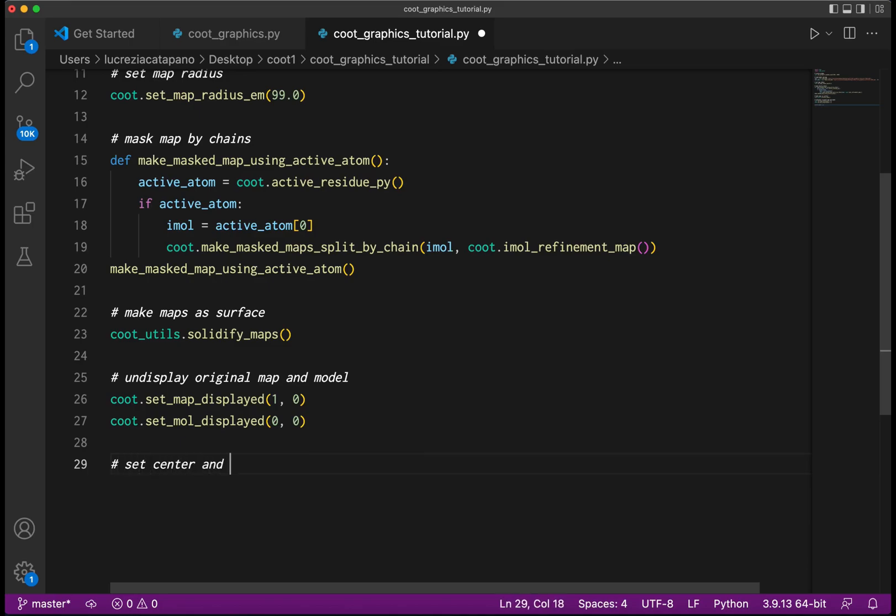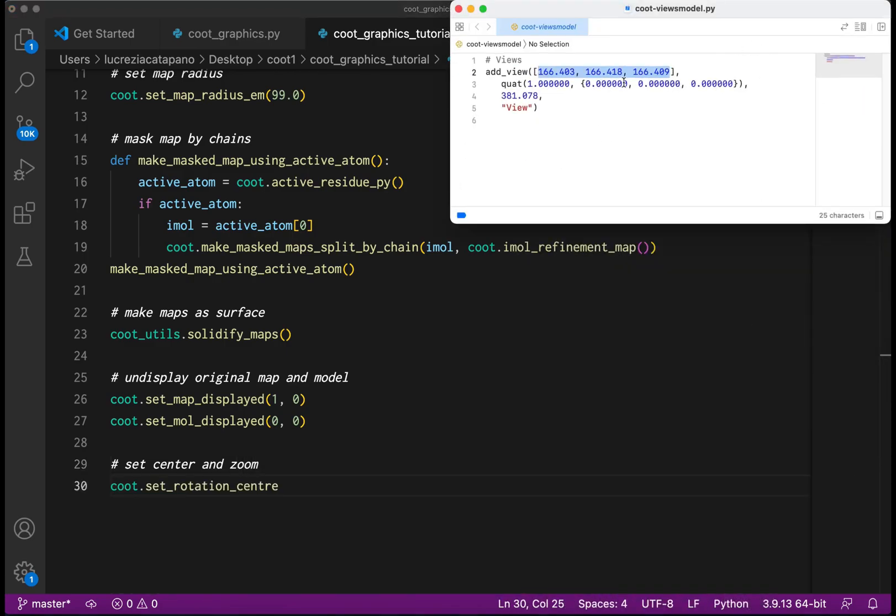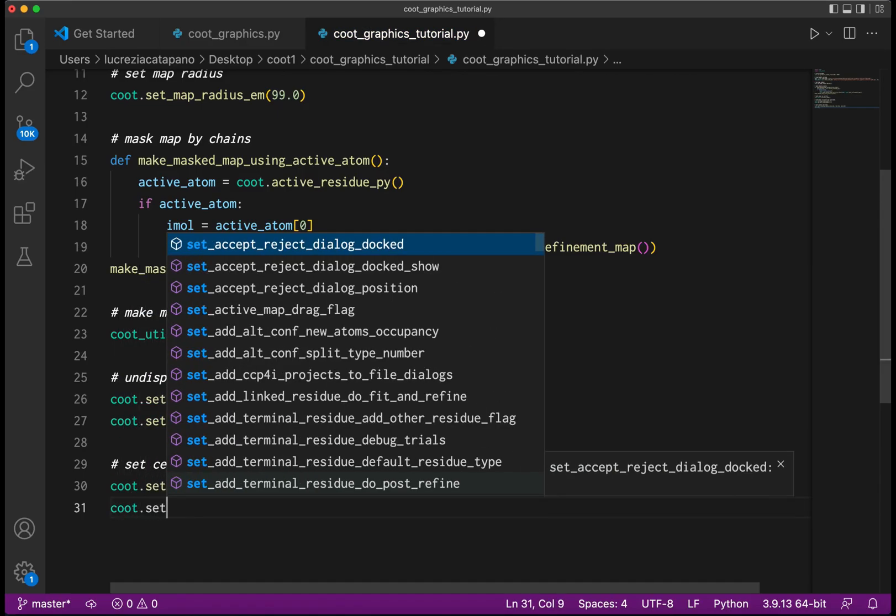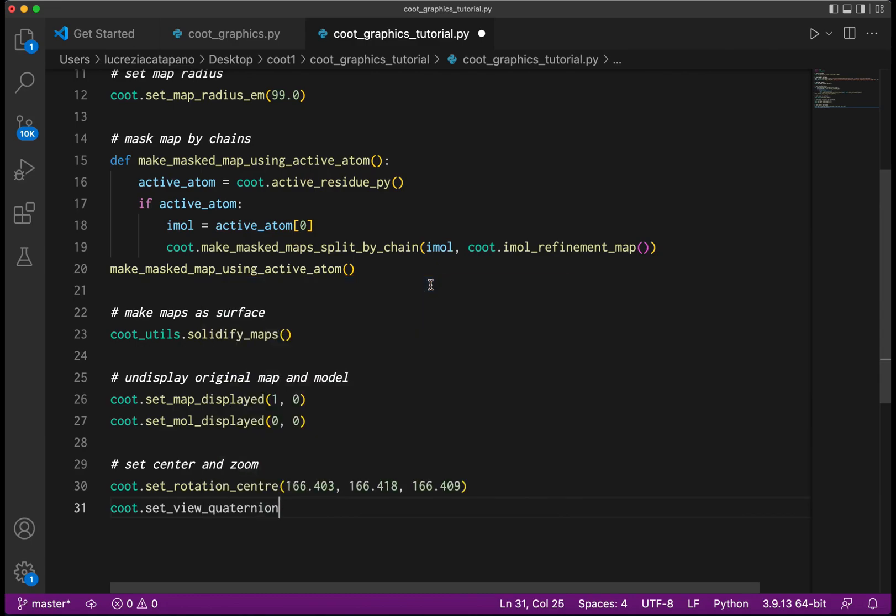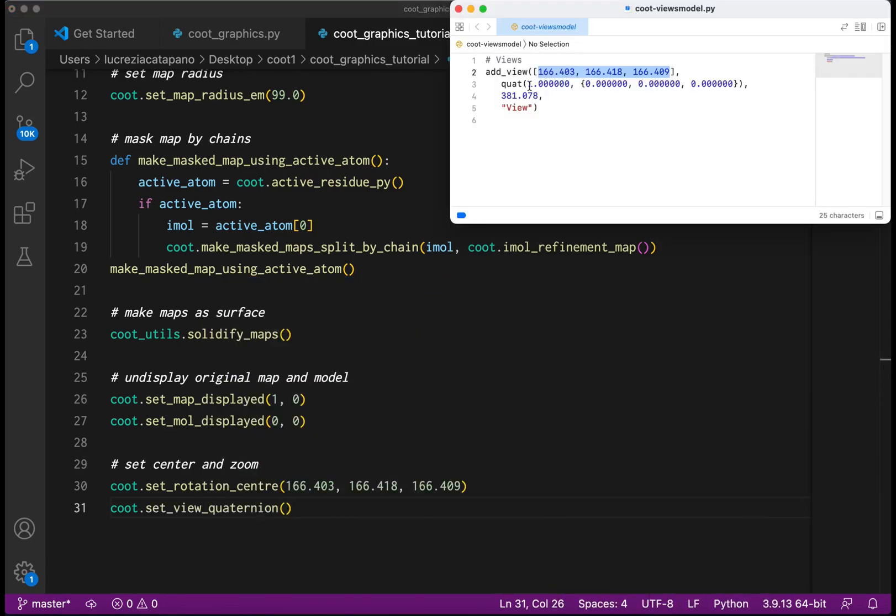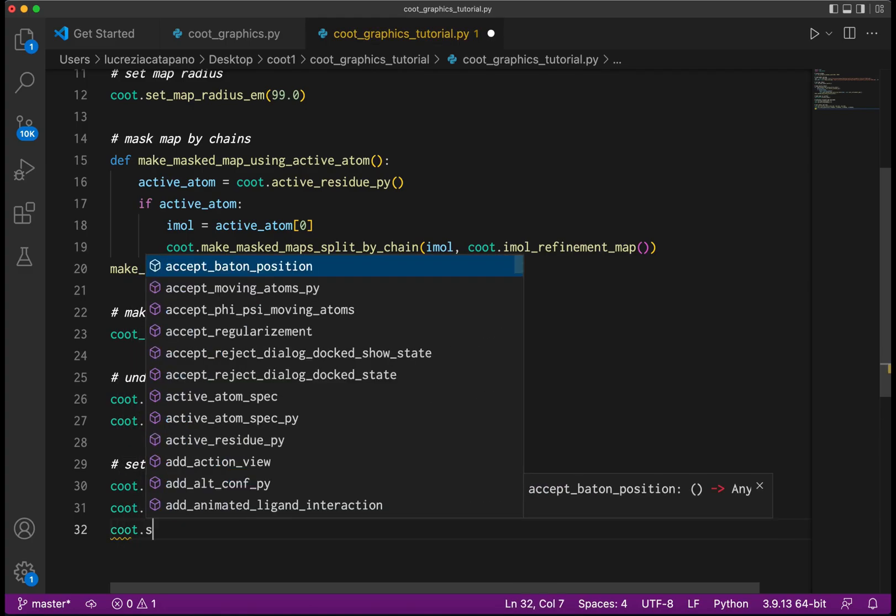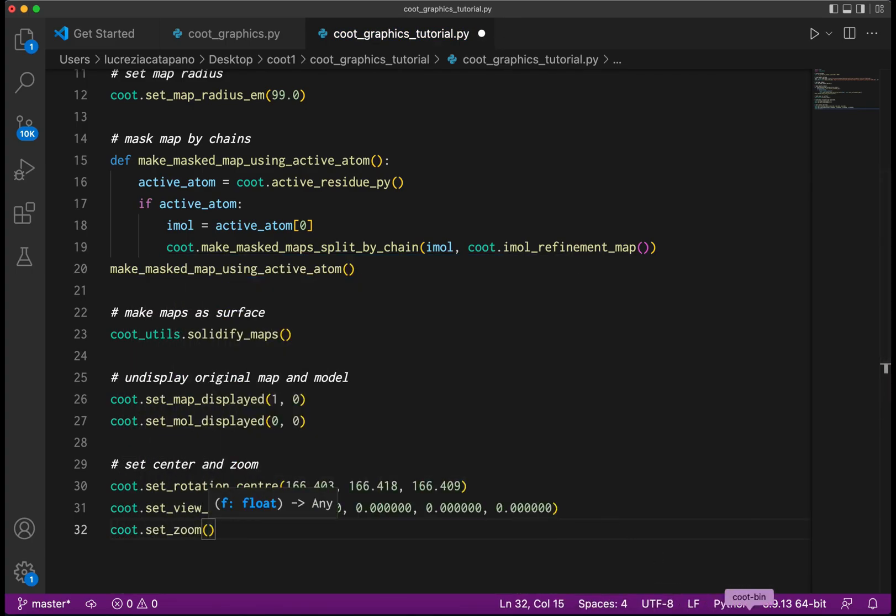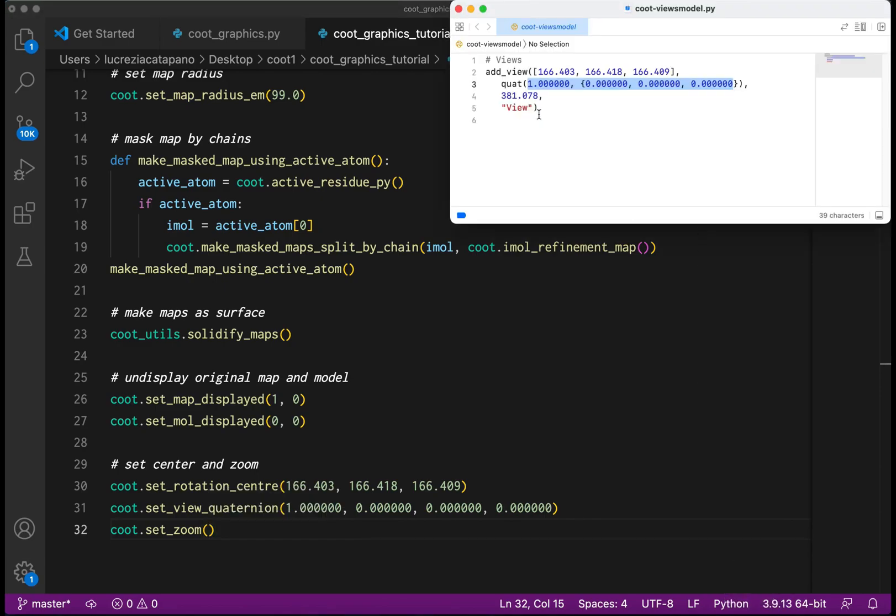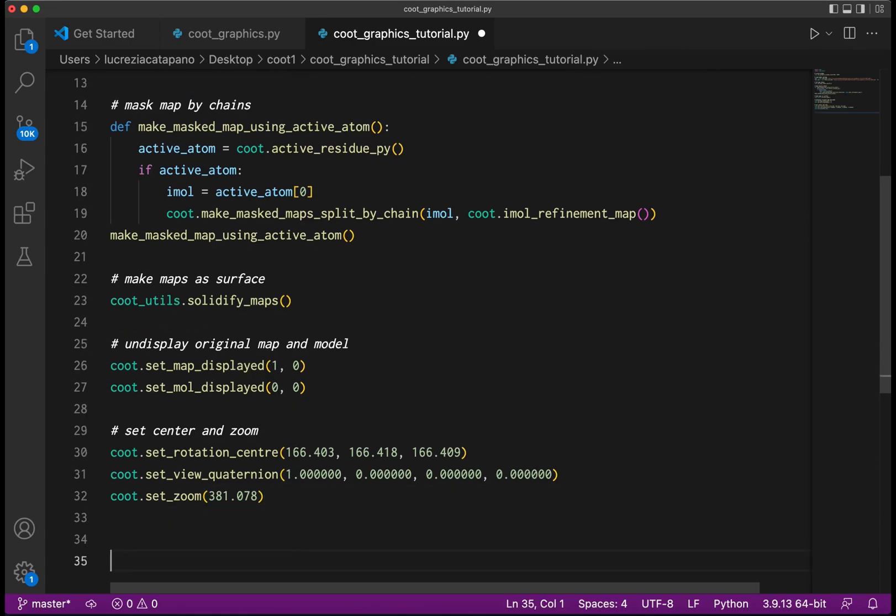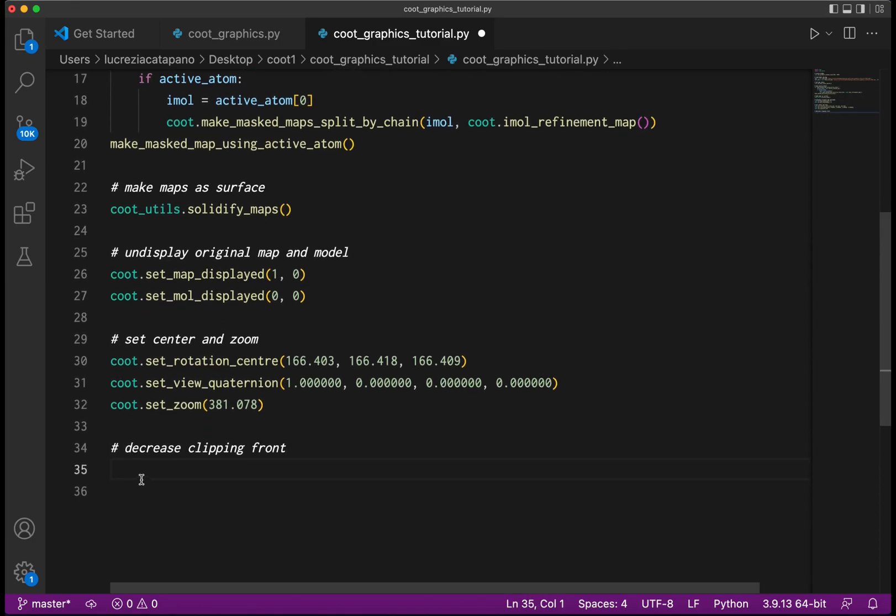Now let's use the map center that we saved recently in part one to set the center. The view rotation is specified by a quaternion. We will also specify the zoom from the view file. The clipping planes affect the colors - in our case we want the front clipping plane to be close to the front of the molecule, so let's pull it in a bit like this.